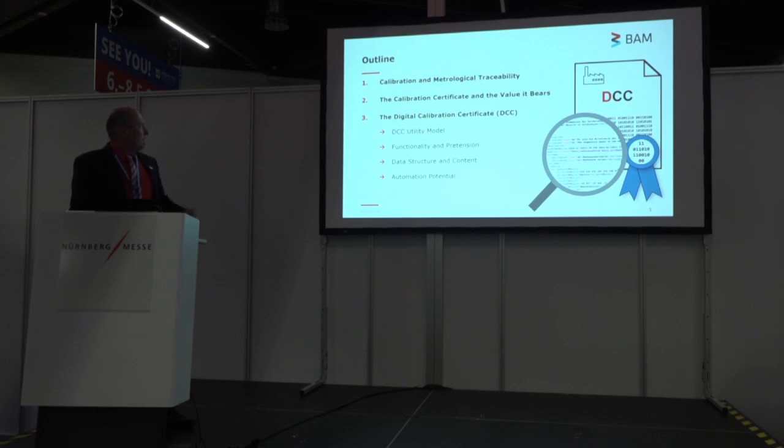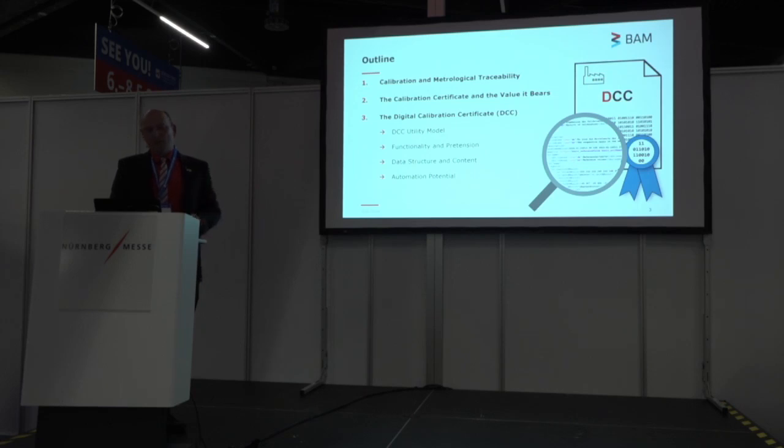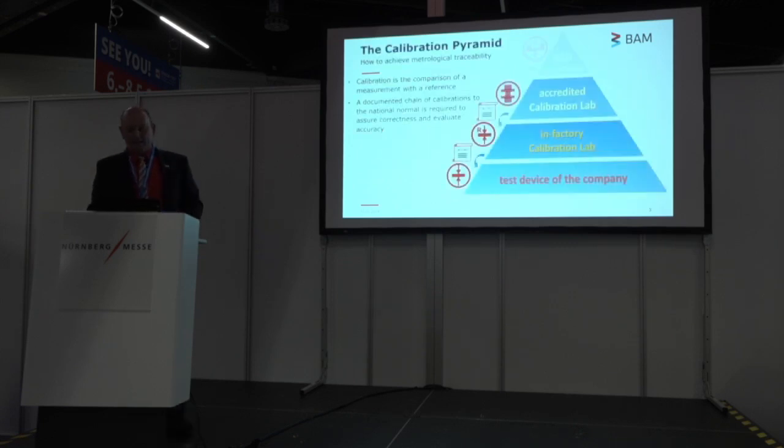First of all, I want to talk about the general information on the calibration and metrological traceability, and then we will check a calibration certificate and what's actually inside it, so the value it bears, and this is then already the motivation and transition to the digital representation of this certificate. I would like to address more specifically you as the user of such a calibration certificate, although I'm representing a calibration laboratory, so we are the ones who issue it, but the actual added value is given at the receiving side of it. So that's why I want to address this a bit more. All right, let's get started.